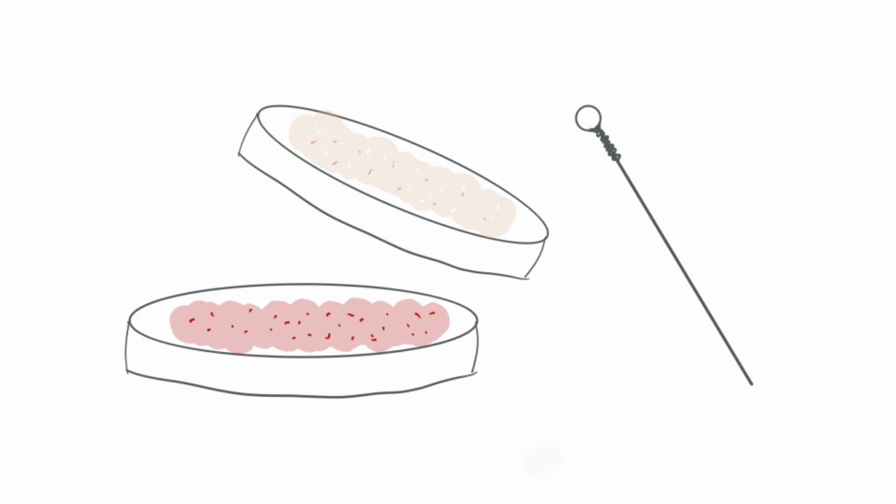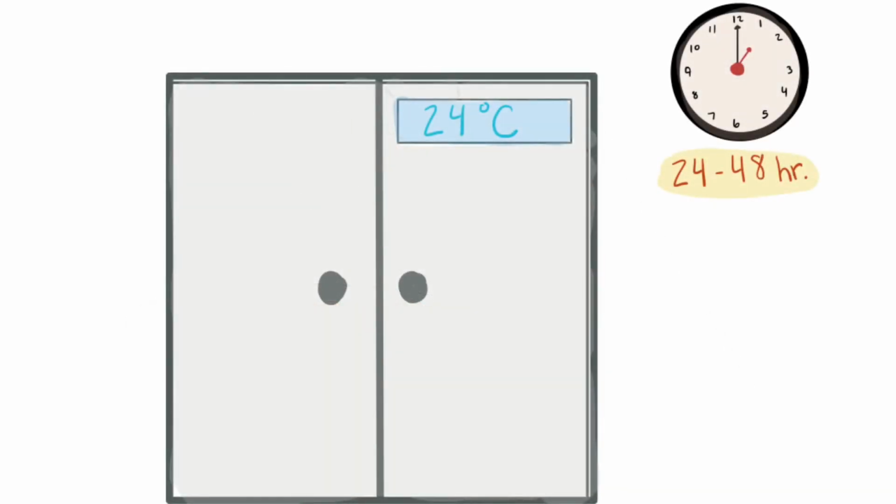After all the mixes are placed onto the labeled agar plate, they are given to a professor to be incubated at 24 degrees Celsius for 24 to 48 hours.